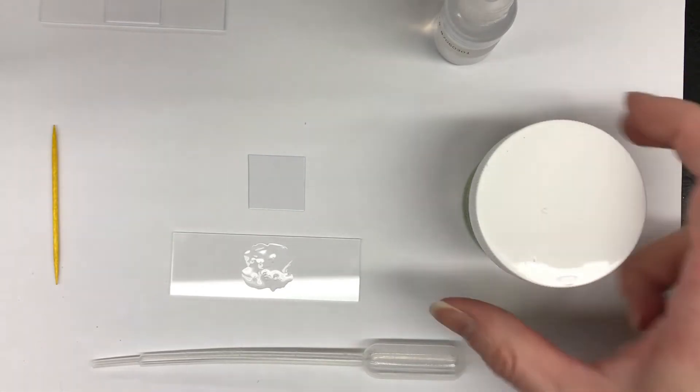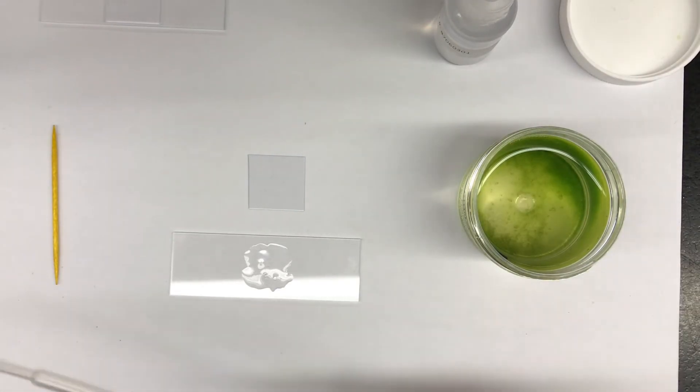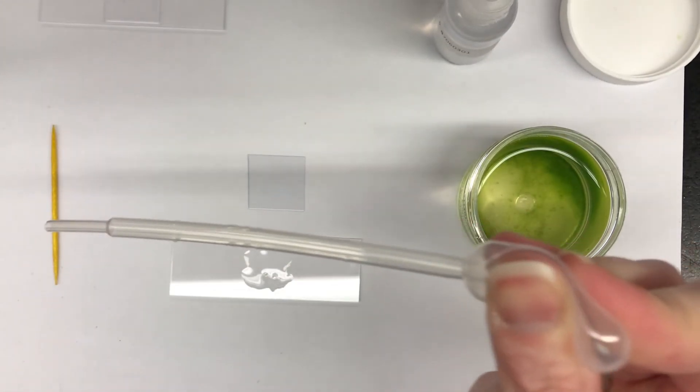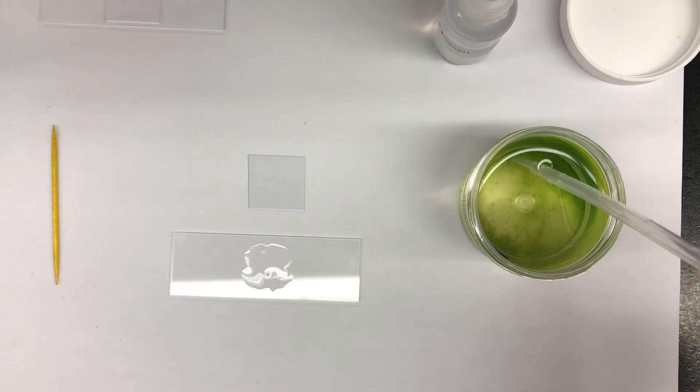Now you're going to take the lid off of your sample. Squeeze the pipette before putting it into the water. We're going to place the tip into the jar and just suck up a little bit of liquid.